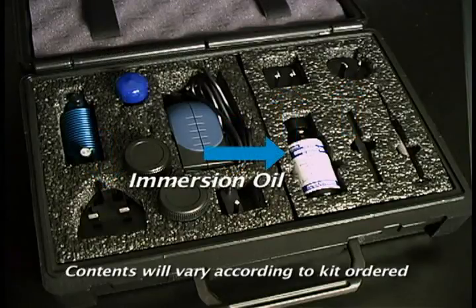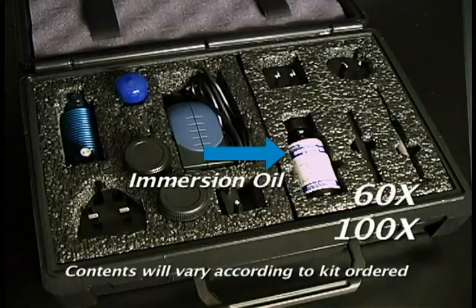Immersion oil is also provided and used when viewing slides with 60 and 100 times magnification.